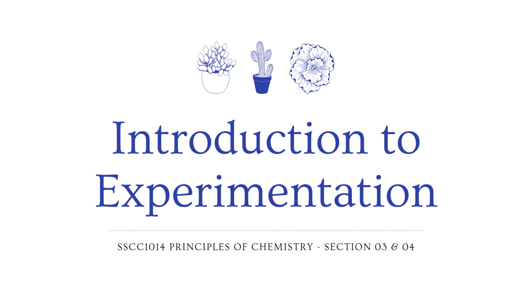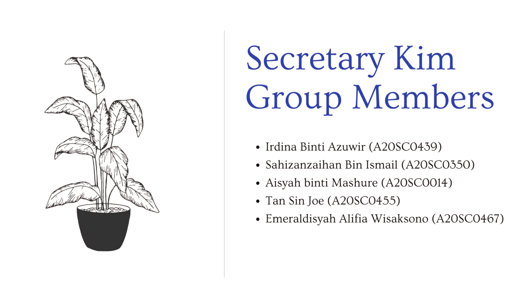The experiment that we will be conducting today is a titration of NaOH solution against aspirin. Now before we begin, I would like to introduce our group members.